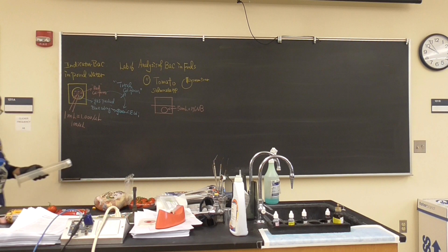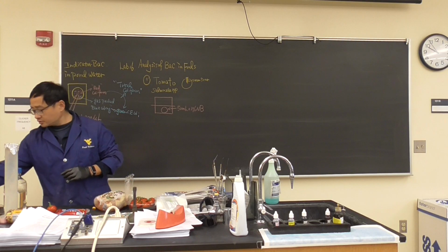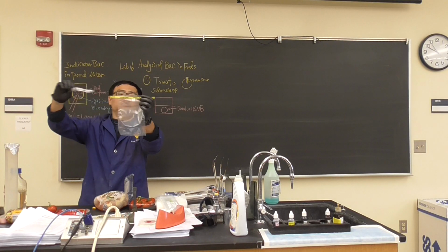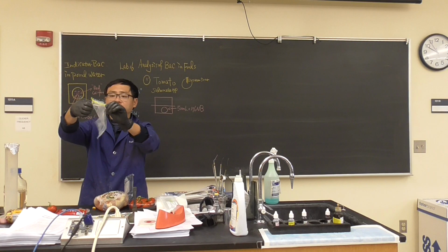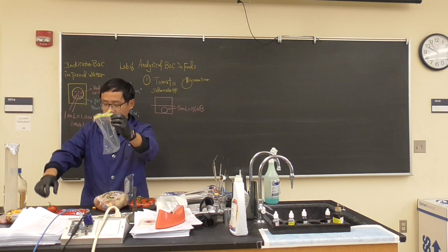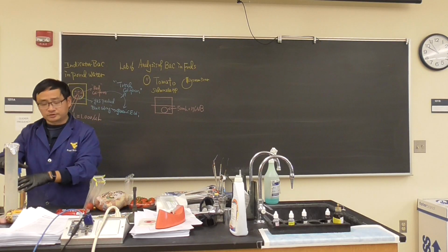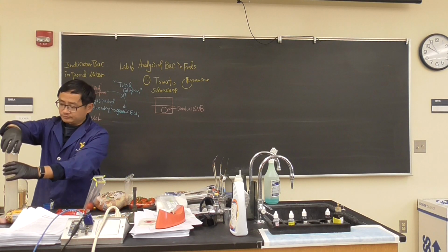We're going to add 50 ml. This is called a food sampling bag, the Whirl-Pak. We tear it off, and then you have a link. Make sure it's a little bit large. Then you put a tomato inside. When you put the tomato inside, we want to discharge the bacteria from the surface into the solution.